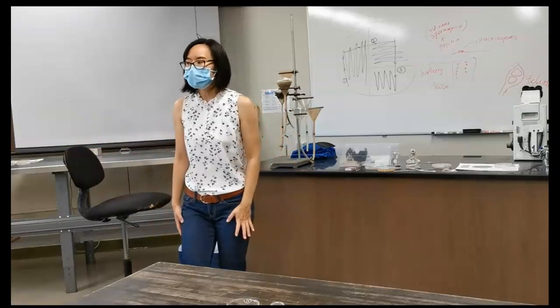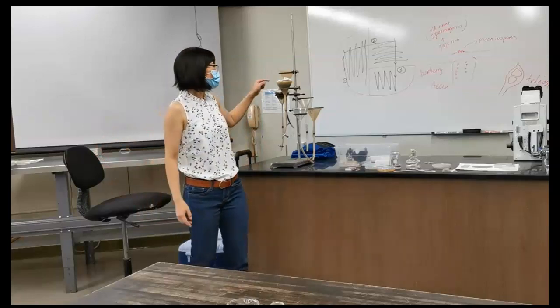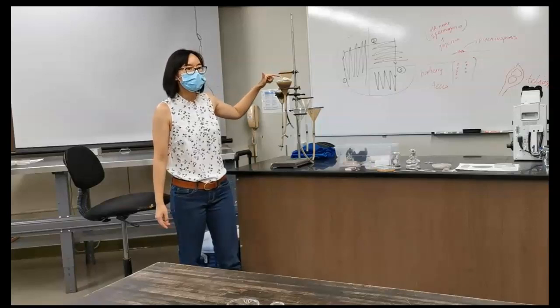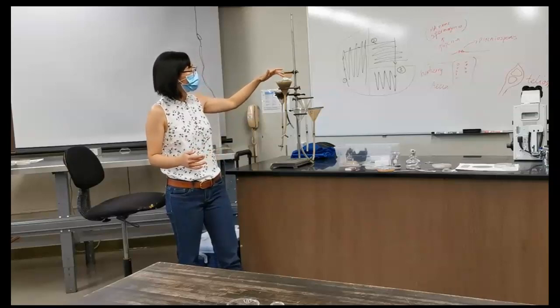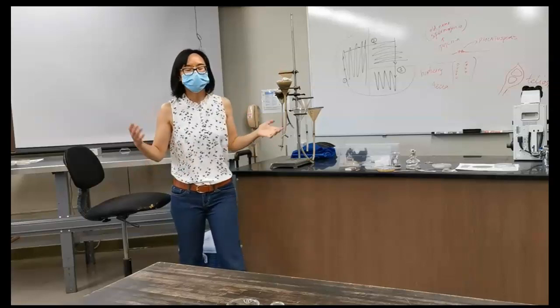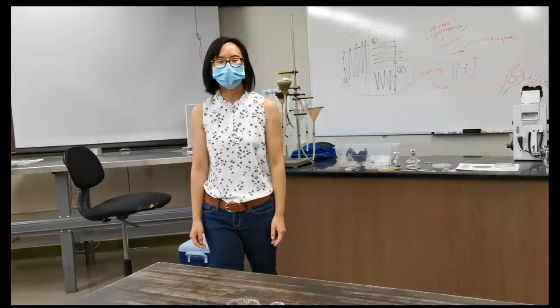And after that, before you leave, I'm going to ask you to toss everything here and then make a new one. So put new soil in wrapped with the tissue paper, and then put it here, and then continue doing incubation for my class for tomorrow.